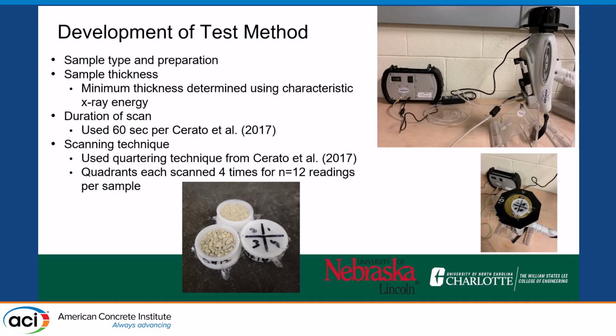And so we were working with sample thicknesses. We were working with the duration of scan. We essentially used what Dr. Serrato had learned from her work with soils. And we also used their scanning technique.